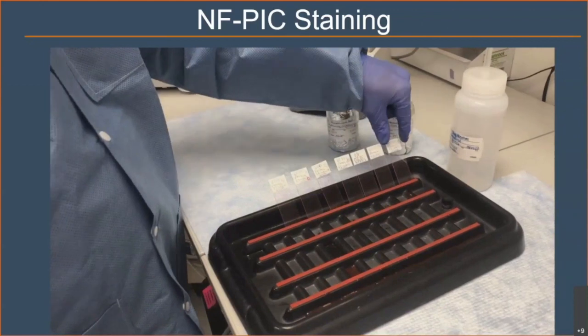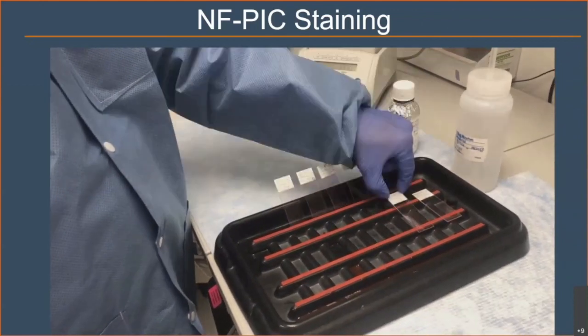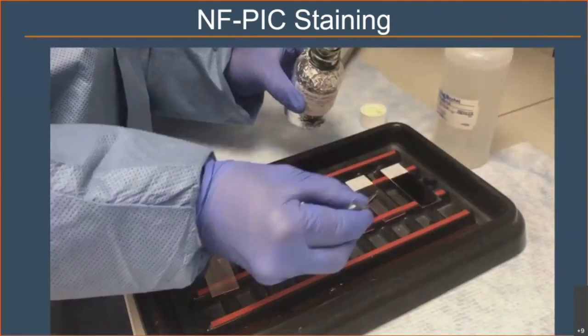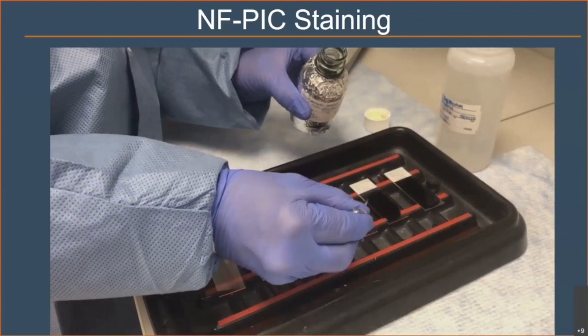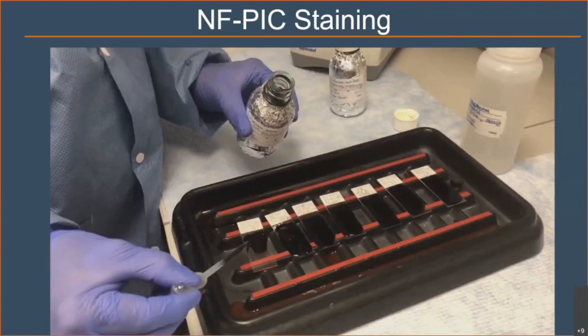And this is followed by the next step, which is the staining with the indigo carmine. The slides are again placed on the slide holder and we flood the slides with indigo carmine. And this staining is done very briefly, for about 30 seconds.